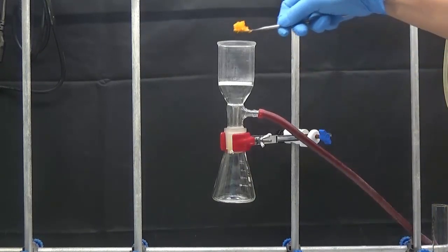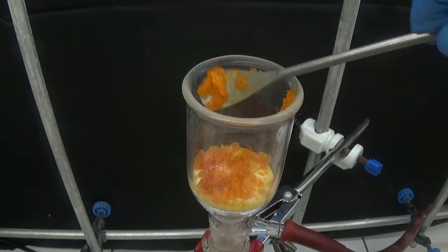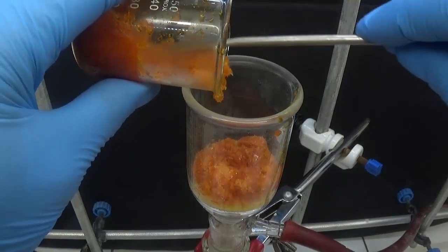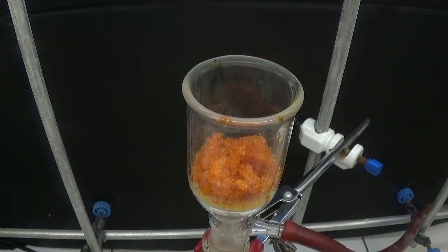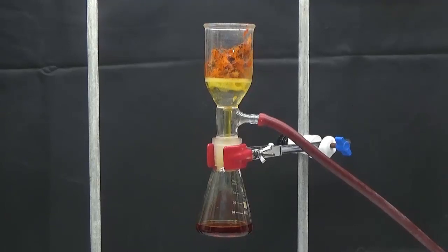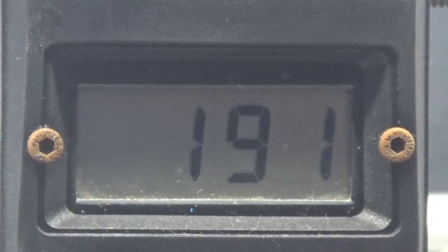The mixture has frozen; we put it into a filter funnel and let it come up to room temperature. We activate the vacuum to remove the acetic acid and collect the purified isatin, then dry it in a kiln at 80°C. The purified isatin has a defined melting point of 191 degrees Celsius.